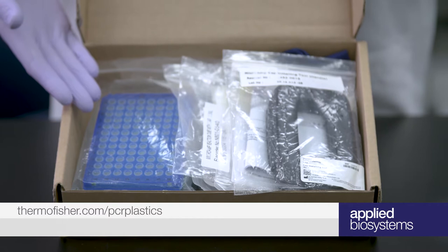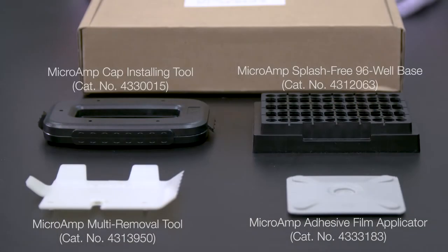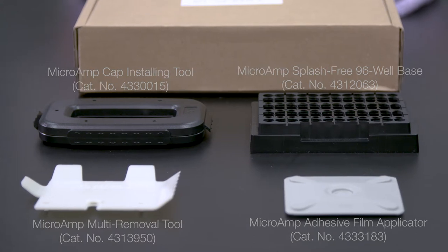You can find everything you need for setting up your PCR reaction in your Applied Biosystems Thermal Cycler Starter Kit or at thermofisher.com/pcrplastics.